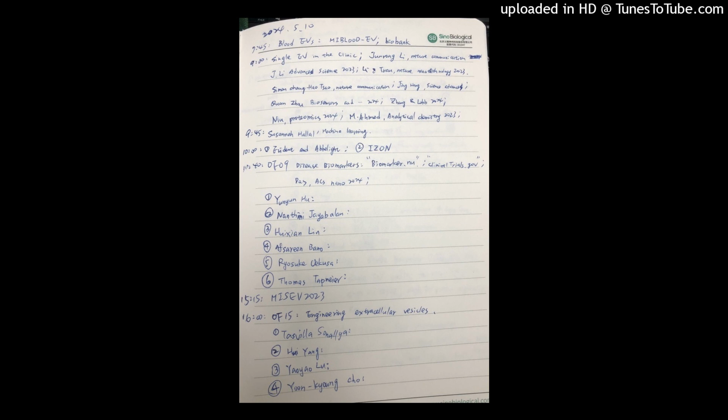This is a summary of this presentation. We demonstrate that tumor CNV status could be detected in EVDNA using ddPCR method. We also demonstrate the potential of CNV analysis as diagnostic and prognostic biomarkers.